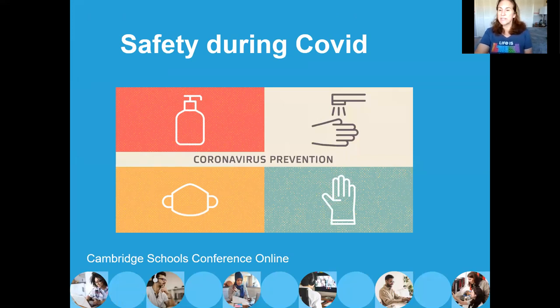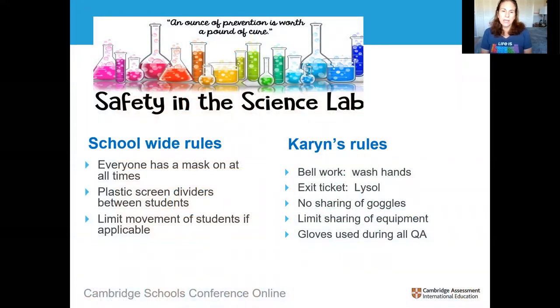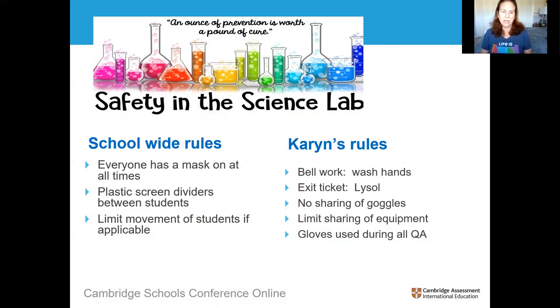The first thing we had to figure out was how to hold face-to-face classes safely. The county came up with a set of county-wide rules: everyone had to have a mask on at all times from the moment you enter campus to the time you leave. The only time it could come off was during lunch when students were socially distanced. The county also purchased large plastic screen dividers to place between students because there was no way to get students six feet apart — you can't change the size of the building. We were also to limit student movement wherever possible.